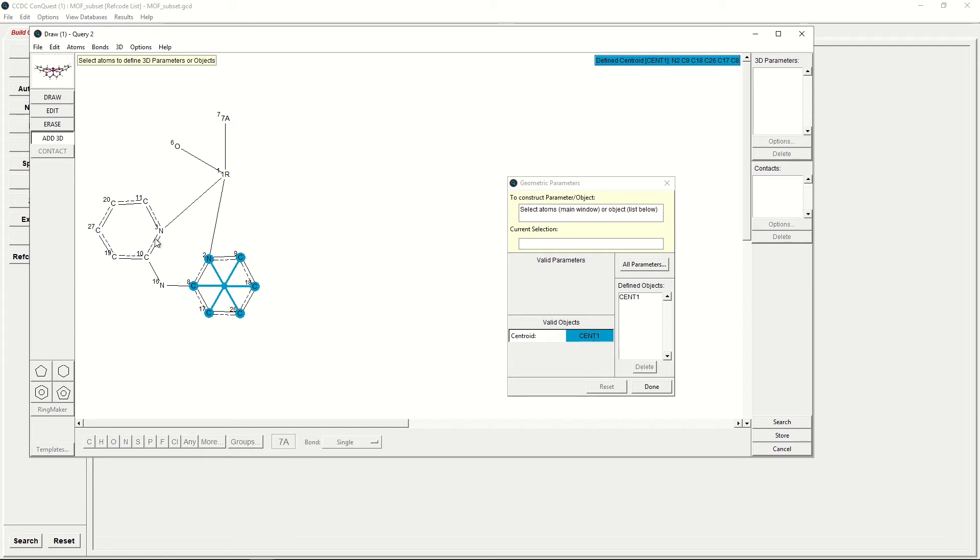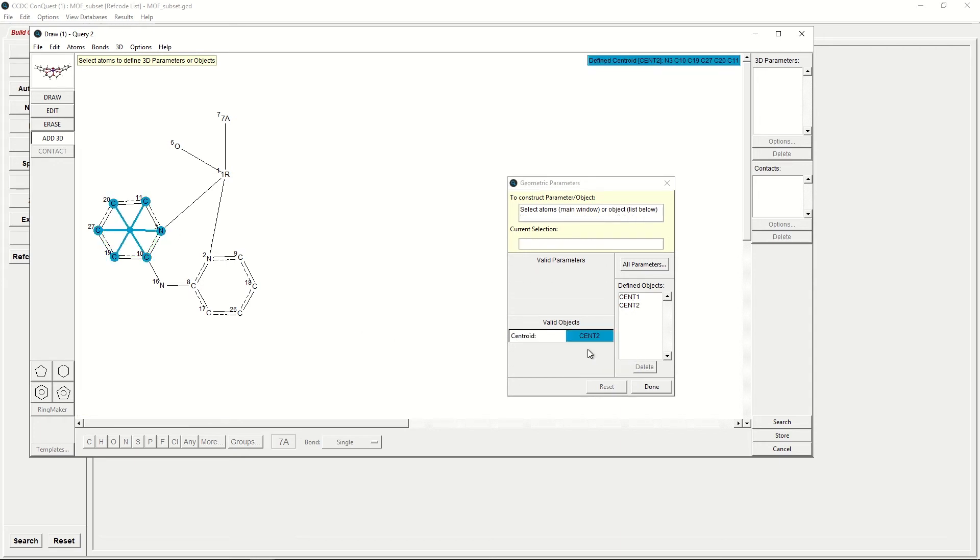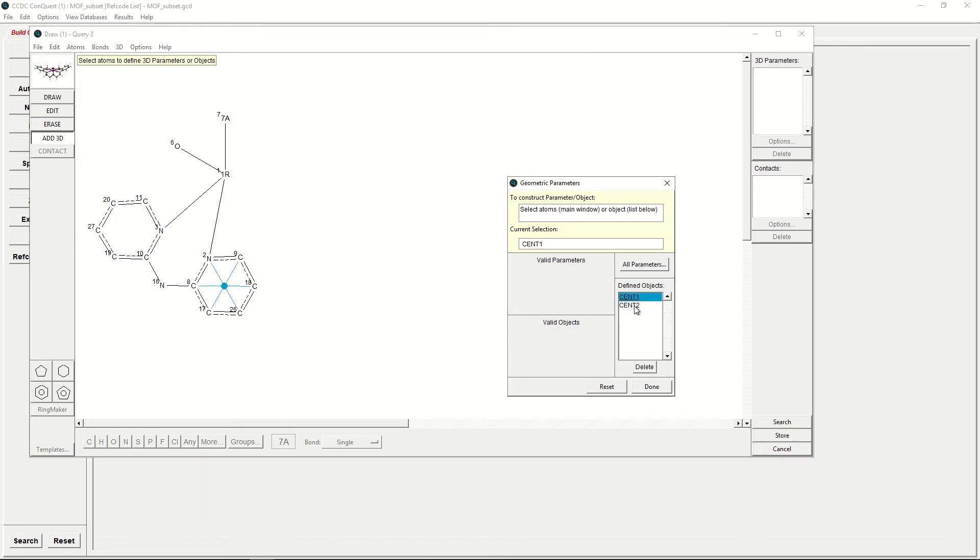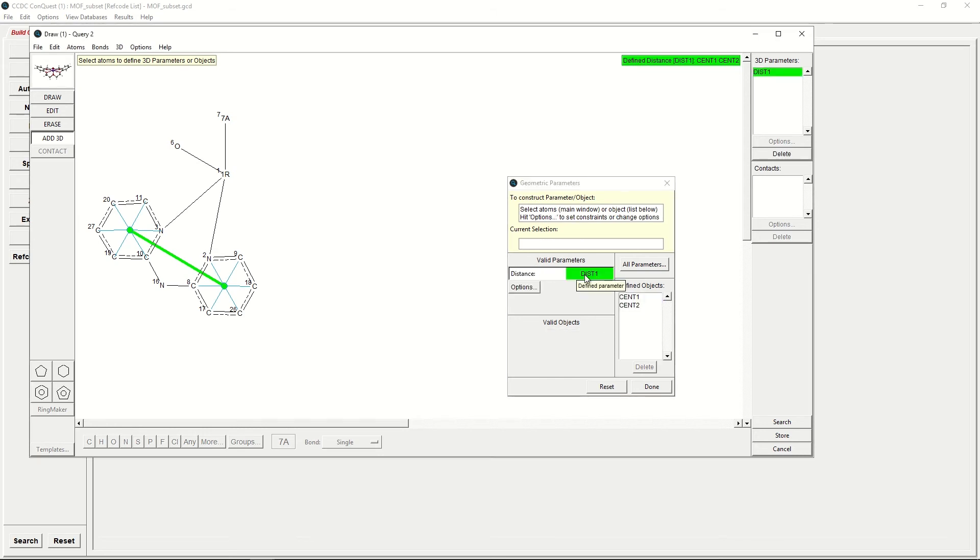We will then do the same for the second ring, and then define the centroid, and this one will be called Cent2. Because we would like to know the distance between Cent1 and Cent2, we can click on Cent1, Cent2. Under Valid Parameters, there is Distance, and we can click Define. That's also come up in the 3D parameters on the top right hand side. Once we're happy, we will click Done.